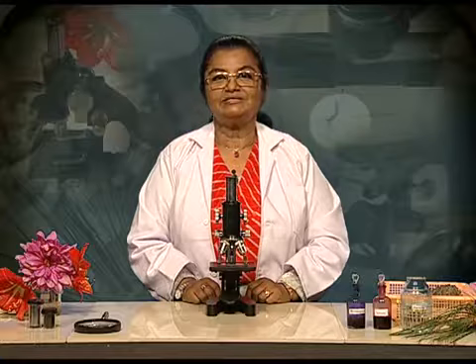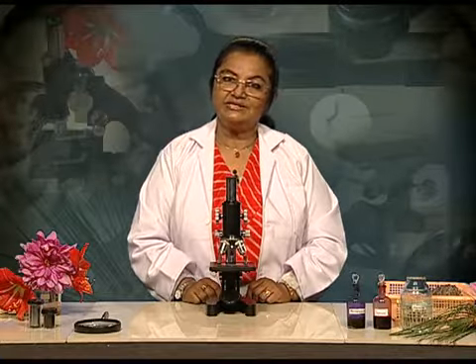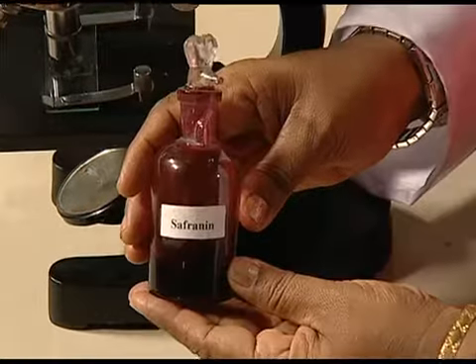What is the advantage of using stains to look at cells? Well, the cells and cell organelles are transparent. Therefore, certain stains are used to enhance the contrast in the microscopic image. They reveal the details more clearly. Some examples of stains are methylene blue and safranin.